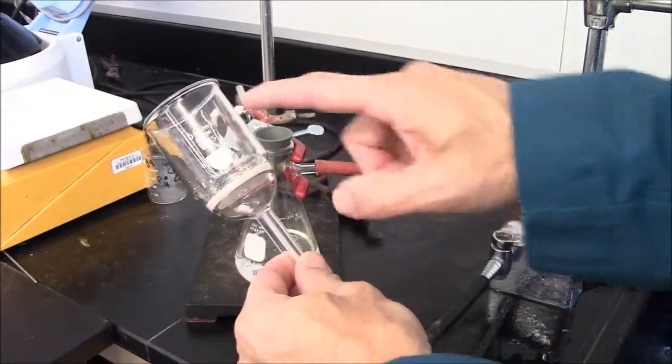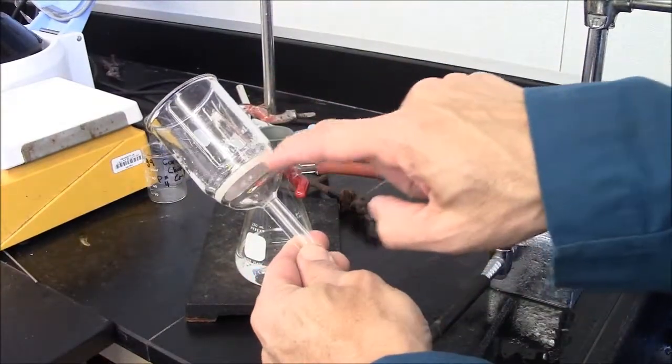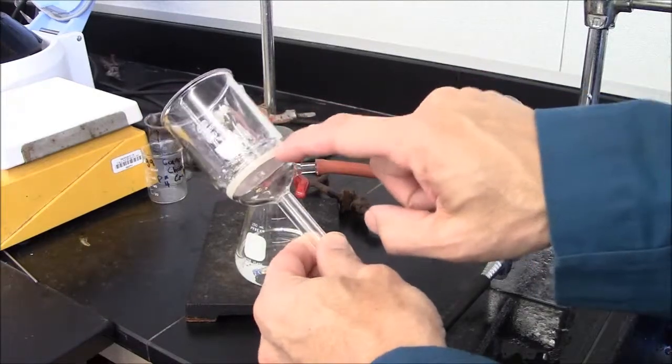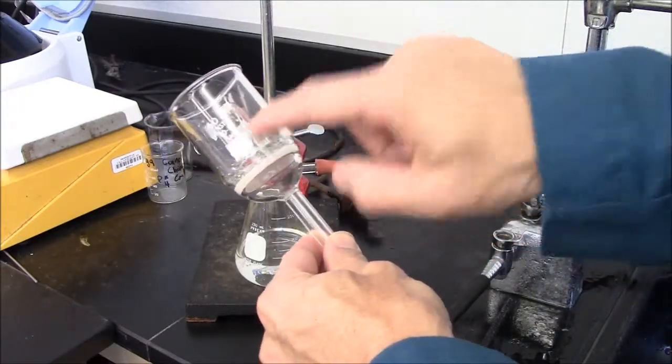Buechner funnel looks like this. It has a sintered glass frit here and it comes in different porosities. This is M for medium.